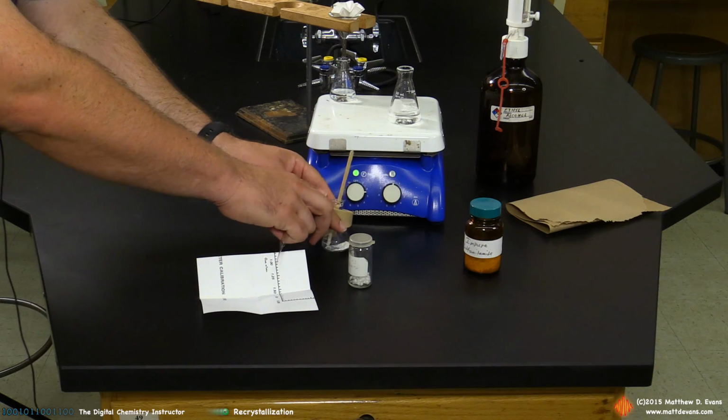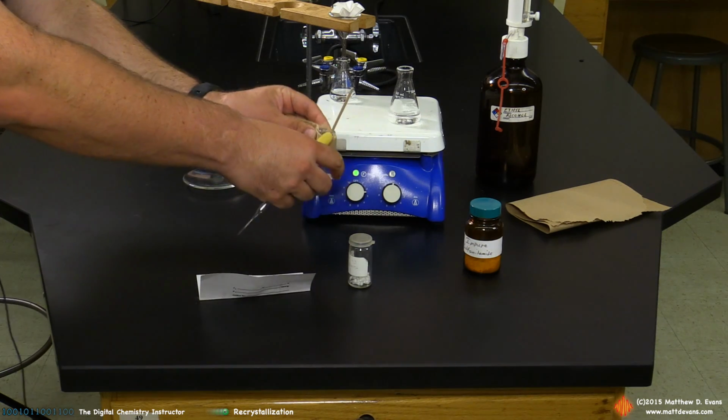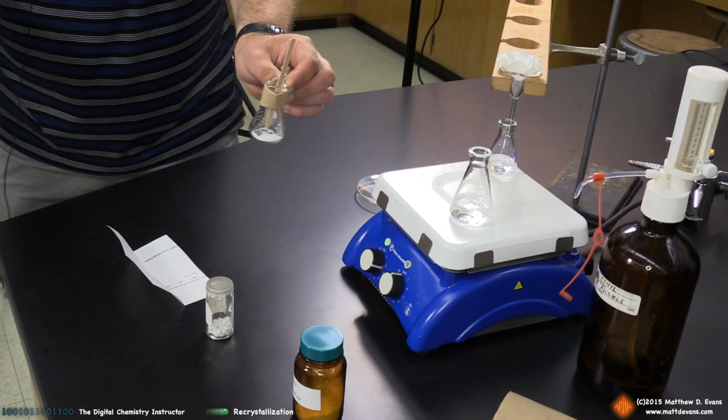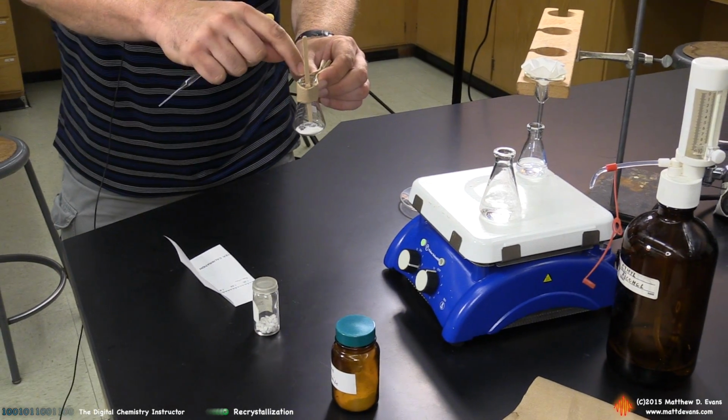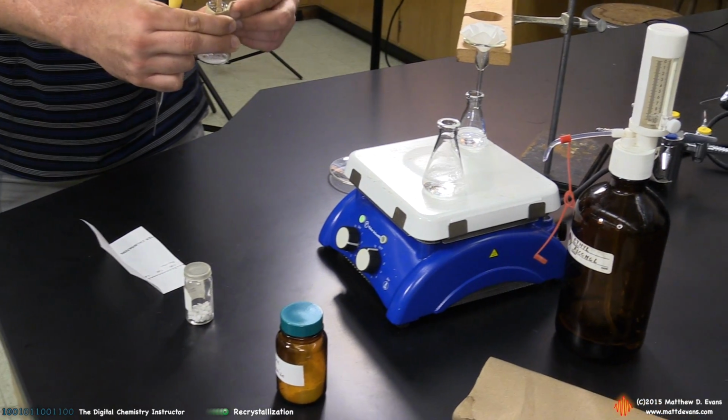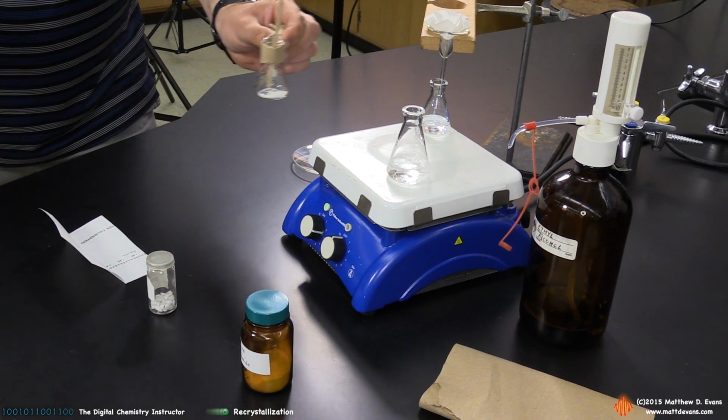These little paper towel handles, you want to make one before you start this recrystallization because this flask is going to be super hot. You don't want to be touching that with your fingers. Furthermore, just the hot vapors coming out of the top of this are enough to burn your fingers, so don't let your fingers get too high on this. I'm going to try to space my fingers back a little bit.